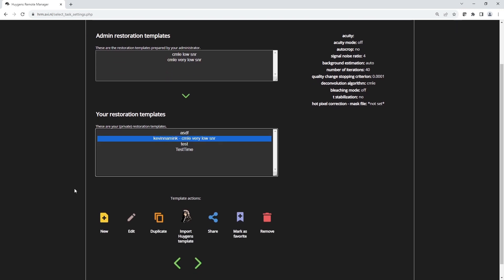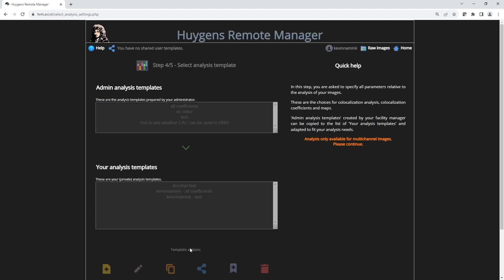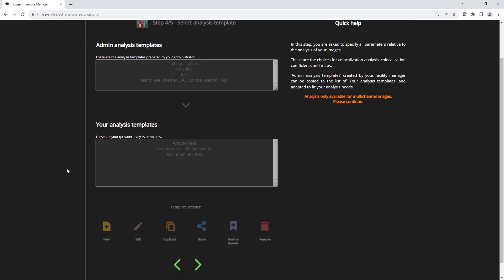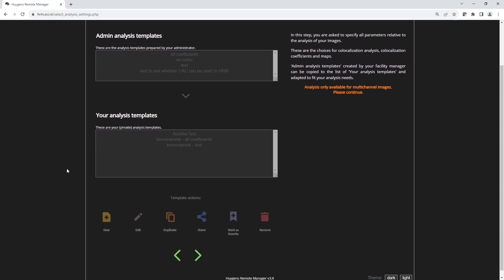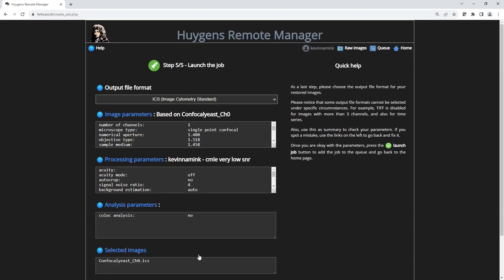In this restoration template, there are a lot of tasks that we have seen in the workflow processor that are also available, but not all of them. Next we can select an analysis template. This image is a single channel image, so a colocalization analysis is not possible. But this task is currently only available in the HRM. Lastly we can review the job before sending it to the server.